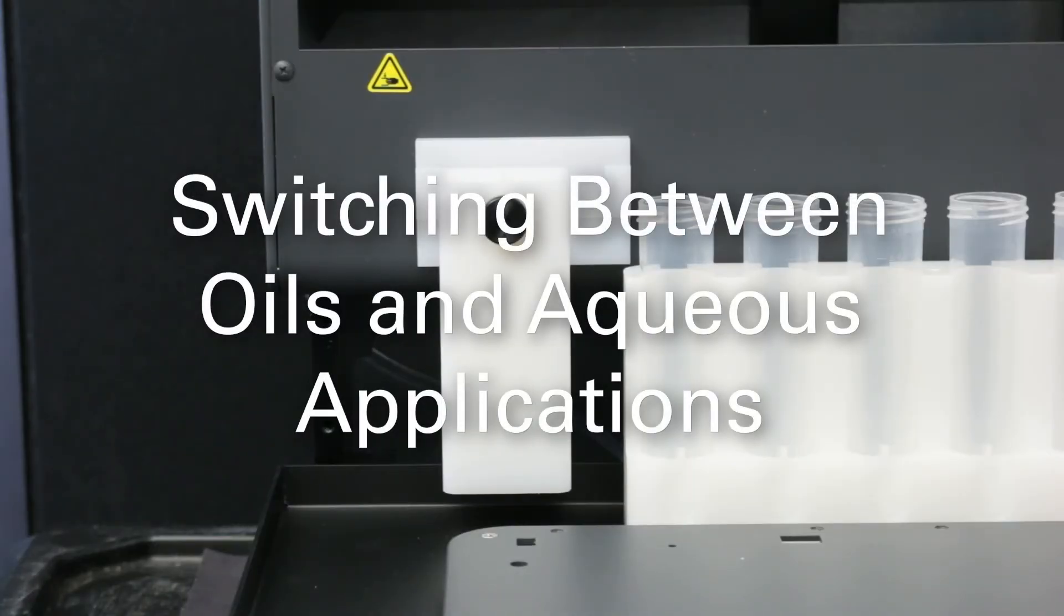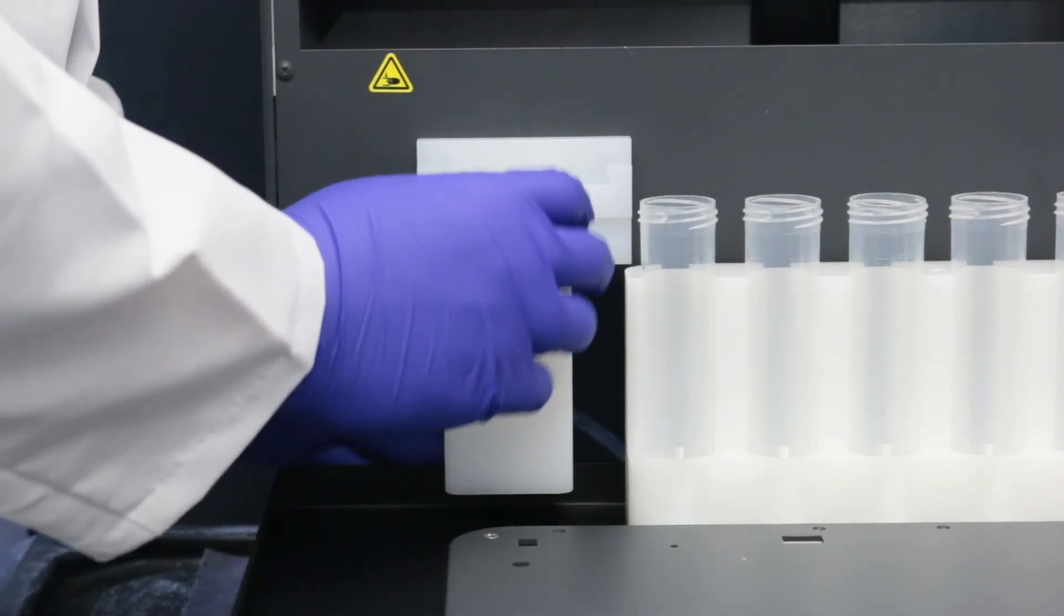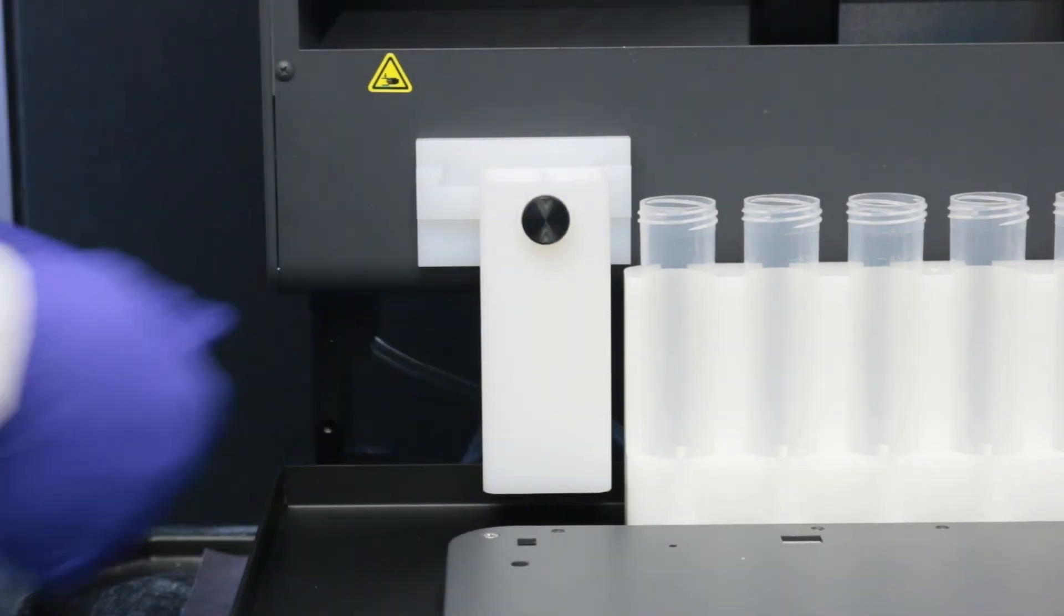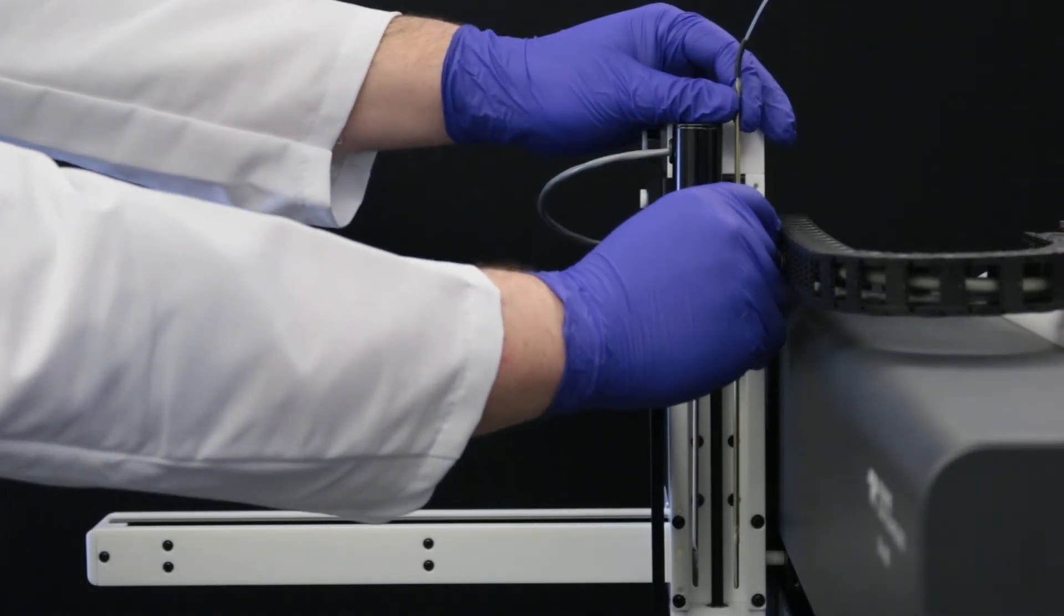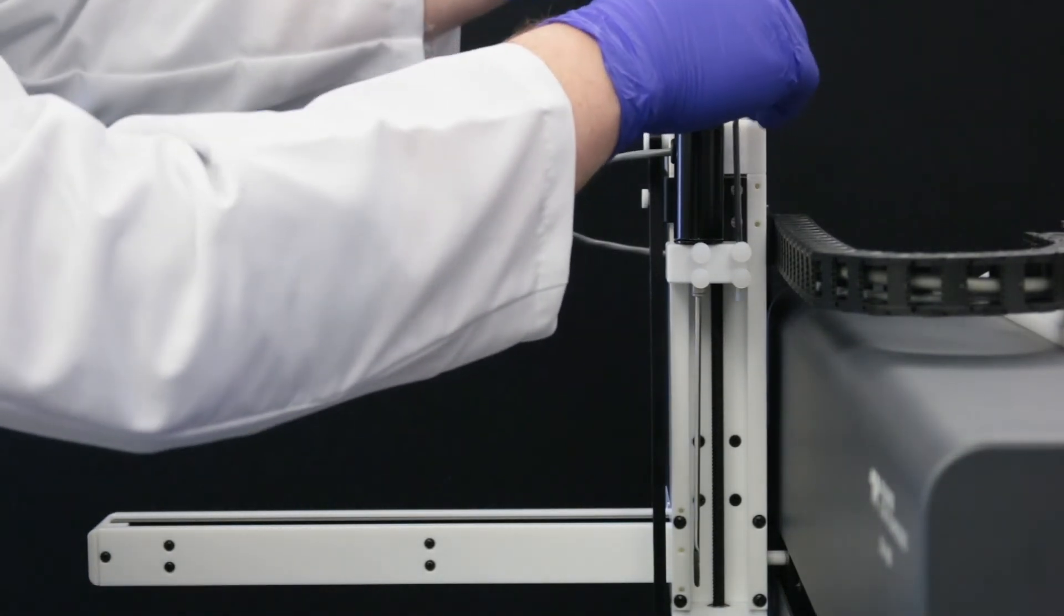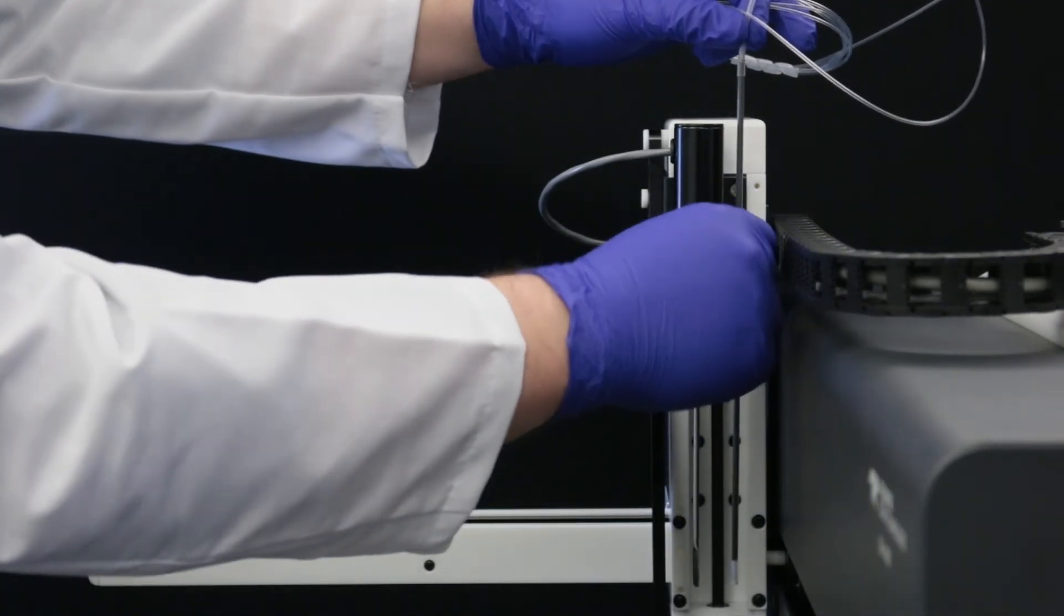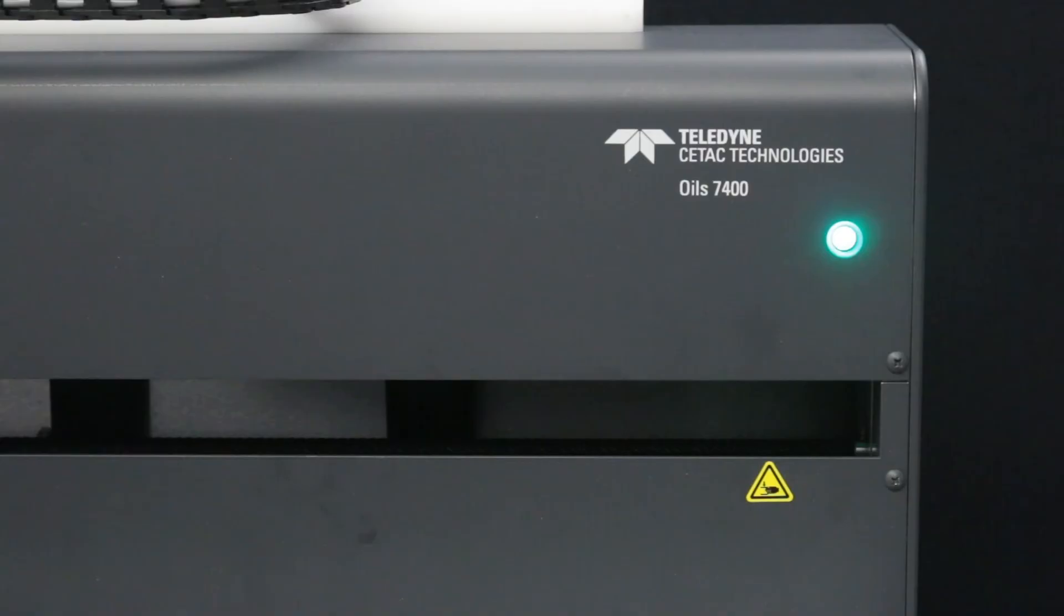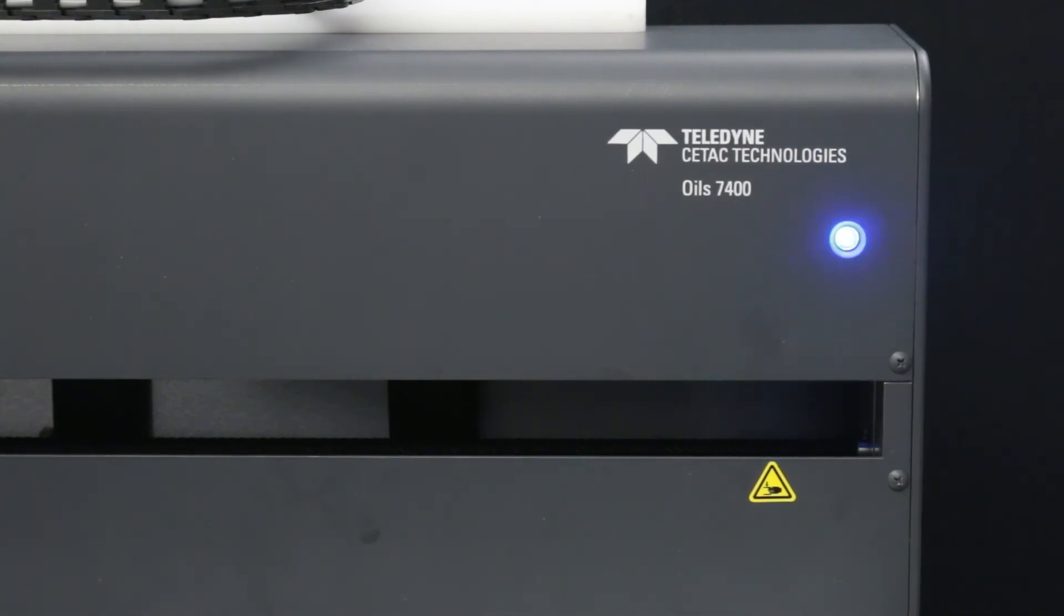Switching between OILS and Aqueous applications. To switch from OILS to Aqueous, simply slide the rinse station to the right. Change the sample probe and remove the OILS paddle. When you move the rinse station, the status LED will change from green, for OILS, to blue, for Aqueous. The peristaltic pump switches automatically.